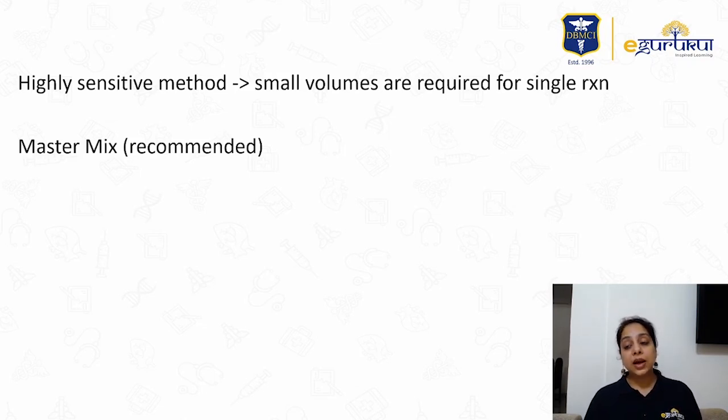And to do this reaction, a master mix is actually recommended, because you have a 96 well plate, so many reactions can be done at one time.